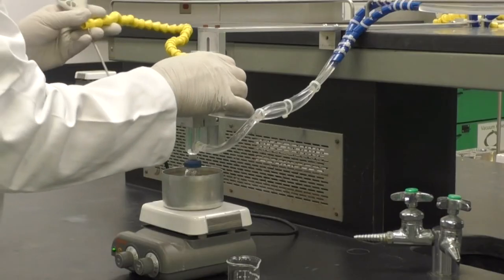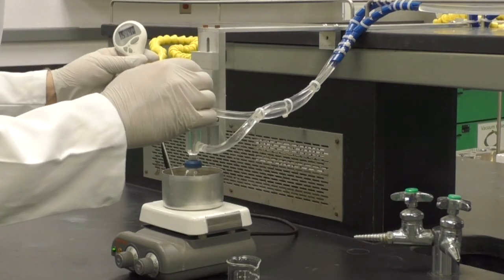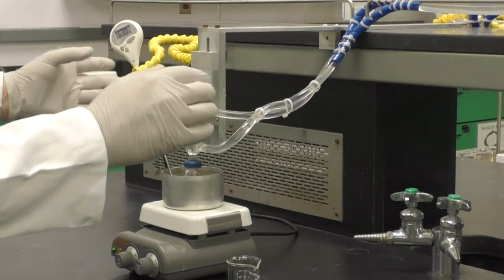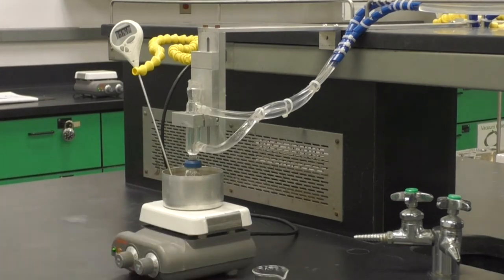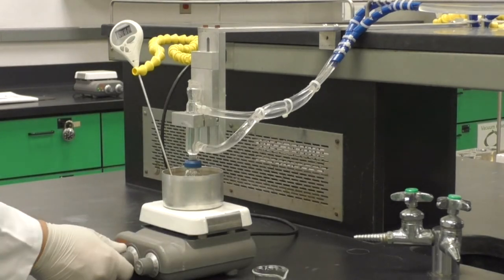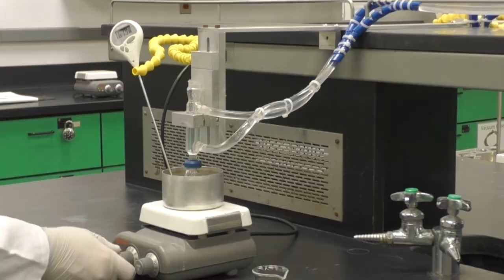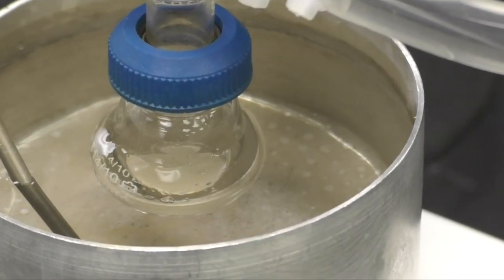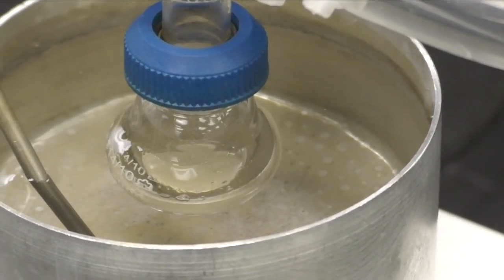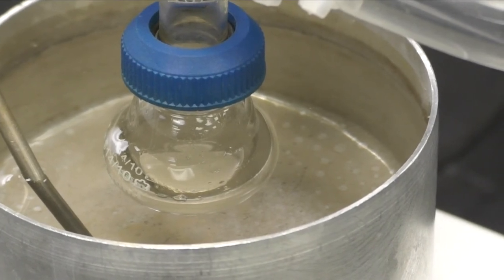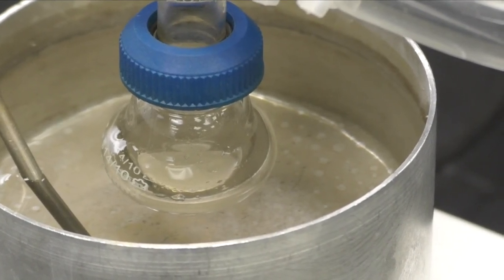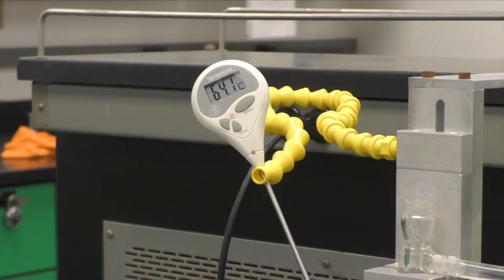Lower the thermometer into the water bath. Make sure the tip of the thermometer is suspended in the water and that the probe does not touch the metal of the water bath. Turn on the heat and set it to about 3. Then set the stirring so an obvious vortex is formed to allow good mixing of the organic and aqueous layers. As the temperature reaches 65 degrees centigrade, adjust the heat to keep it right around that temperature and begin timing for 15 minutes.